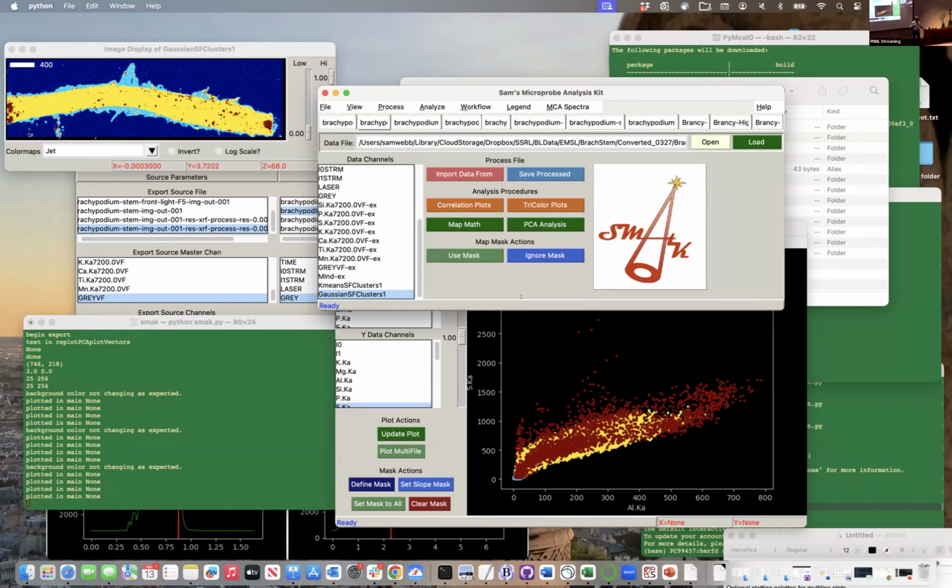One of the things I was also thinking about yesterday is, if we're exporting images from what we're generating, like the top left, are you also including OME-TIFF, these multi-layer TIFF images where you could have more than one data stream? Yeah, so not right now. That's actually a good idea. I like that.